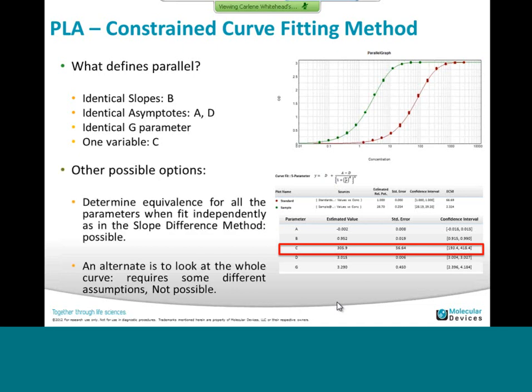As I was saying, for those nonlinear regressions, you have other possible options, which would be to determine the equivalence for all the parameters when fit independently, as in the slope difference method. And there are other methods that look at the curve as a whole, and that requires different assumptions, so it's not possible to cover here.